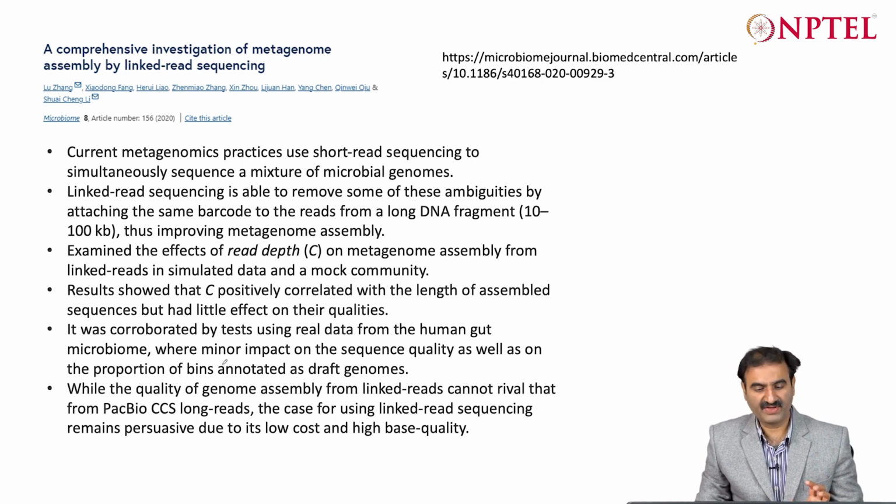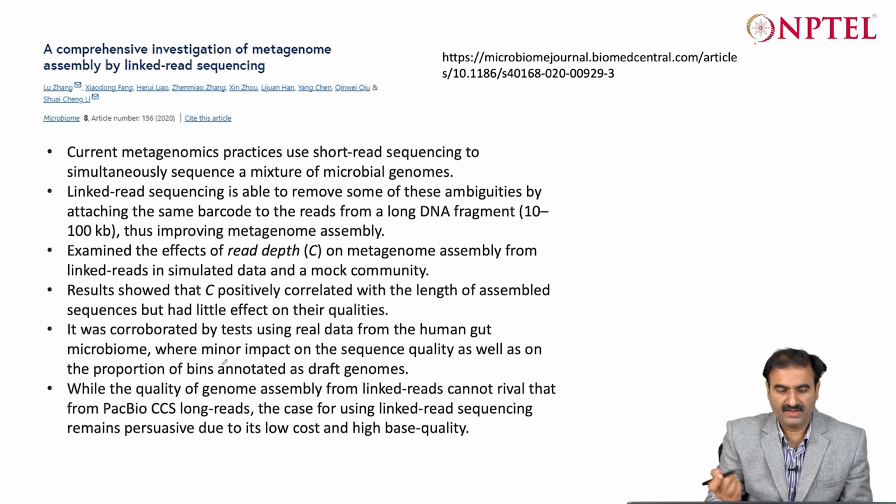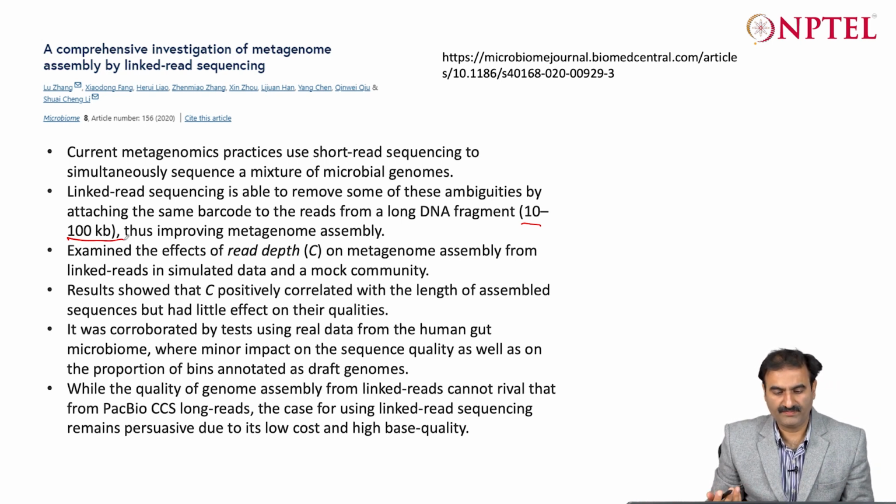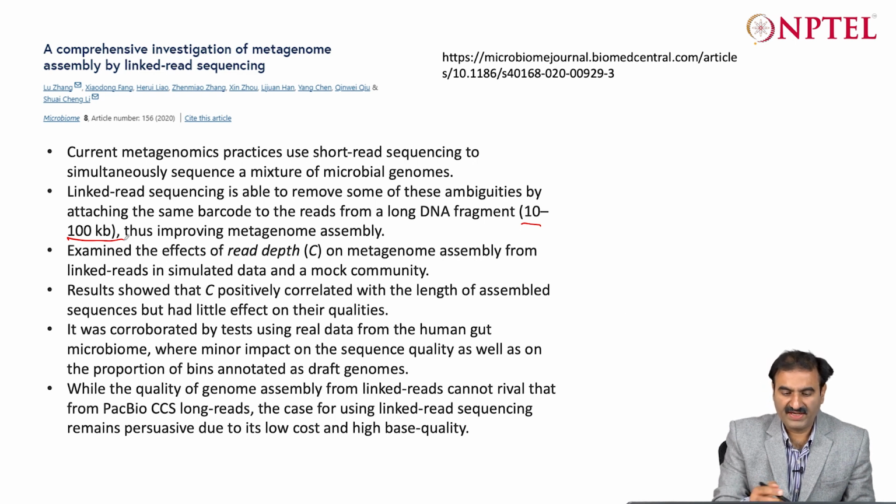So basically linked reads can be used, and they showed that they could generate DNA fragments up to 10 to 100 kb long. They also showed the effect of read depth on the metagenome assembly and how linked reads can be used for that.